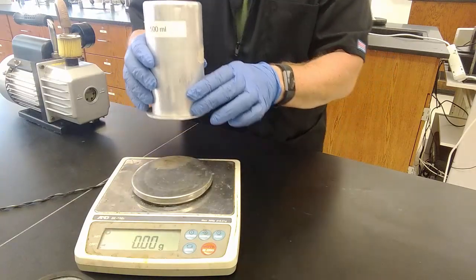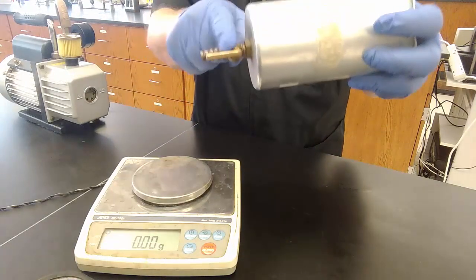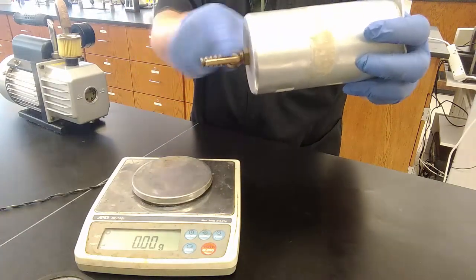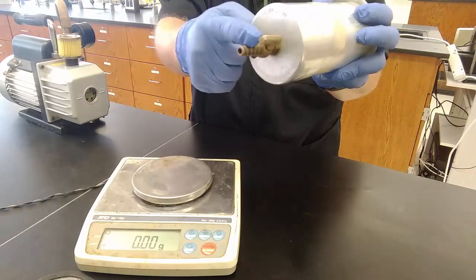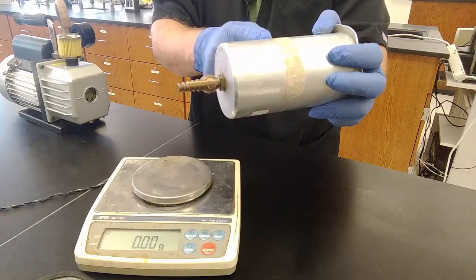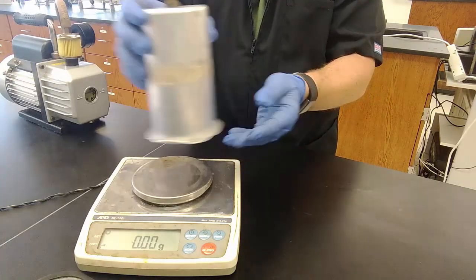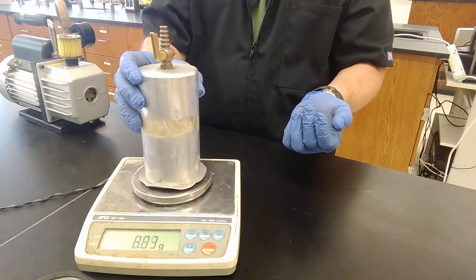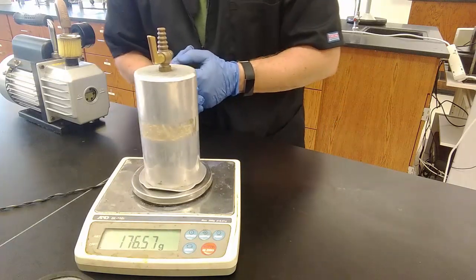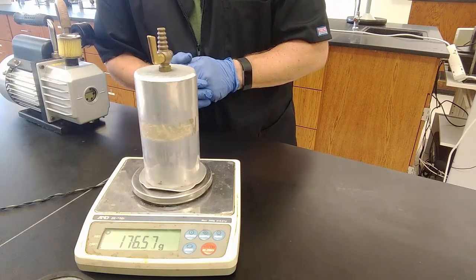All right, so again, not touching the table. The valve is open, right? Whichever way the handle is placed is where the hole is. So the hole is now out through this nipple into the room and into the densitometer. So it's open. So what's filling this densitometer now is it's full of air. I'm going to weigh it full of air because that's what it says in step 2. Open the valve on the densitometer. Oh wait, no, it says do it first.